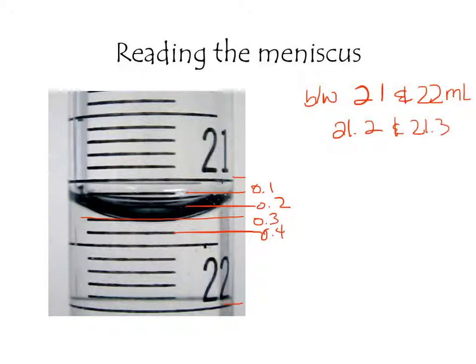21.3. So technically you could say it's exactly on 21.3, but in my opinion, it looks like it's about 21.2, and here's where I estimate. So it's so close to that 21.3, I'm going to add one more number, and this number is going to be the arbitrary number.